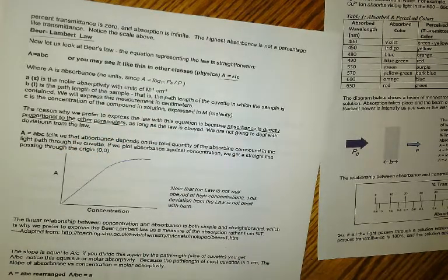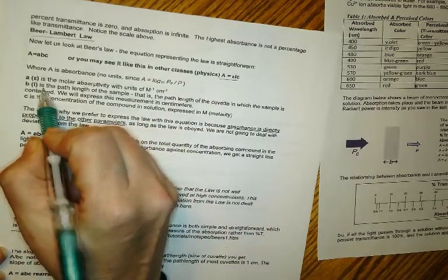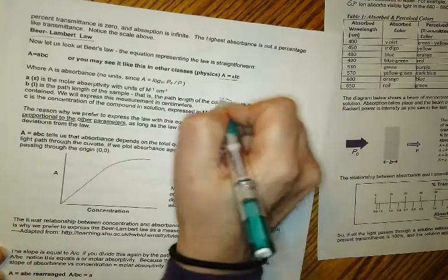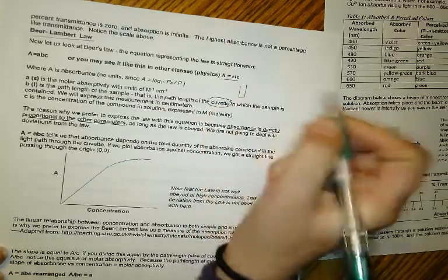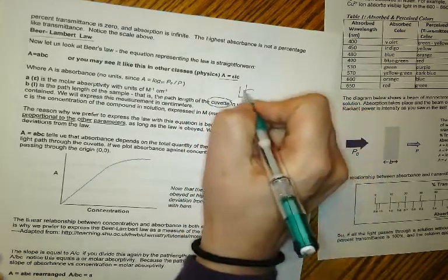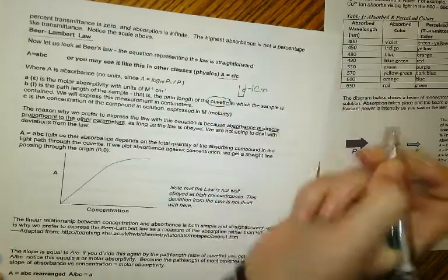If it is absorbing more of the light, it's going to have a higher molar absorptivity, times concentration times the path length. And remember, the path length is that cuvette, that little cube that has the sample in. In general, this cuvette is usually 1 centimeter.